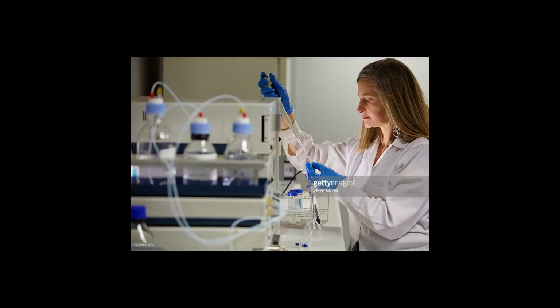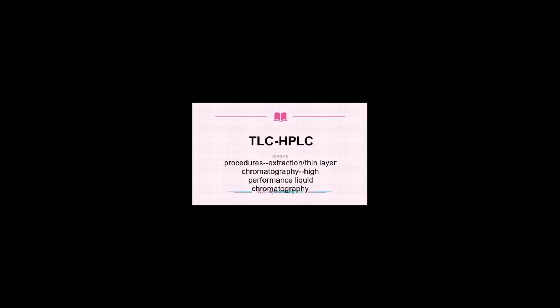The binding of the analyte to the stationary phase is proportional to the contact surface area around the nonpolar segment of the analyte molecule upon association with the ligand on the stationary phase. This solvophobic effect is dominated by the force of water for cavity reduction around the analyte and the C18 chain versus the complex of both. The energy released in this process is proportional to the surface tension of the eluent.